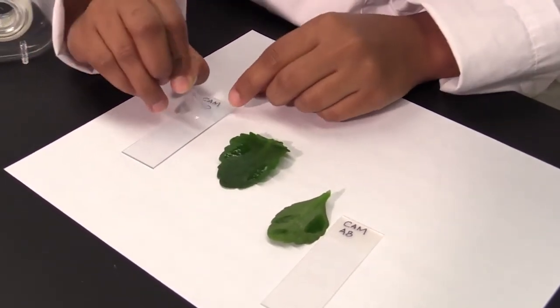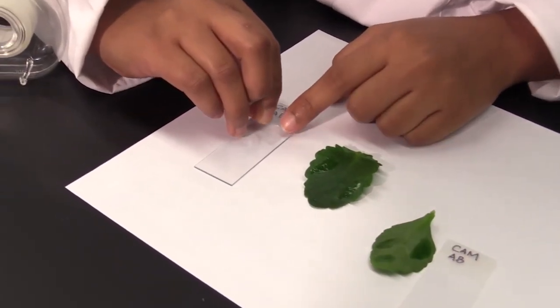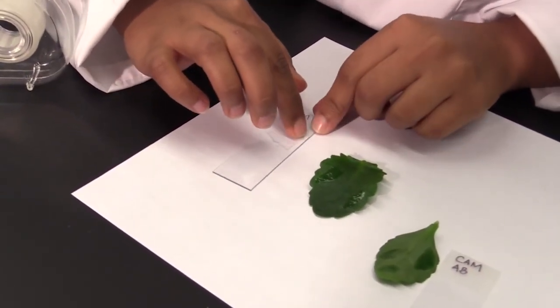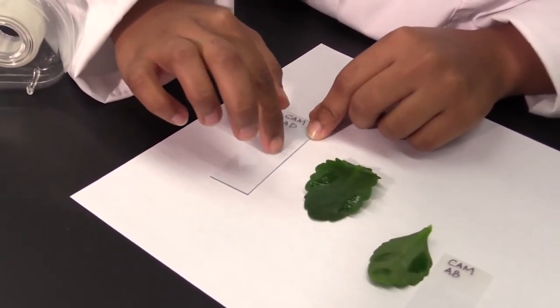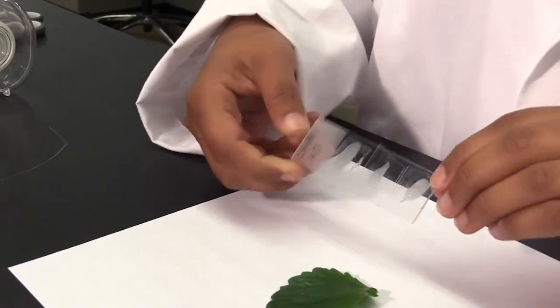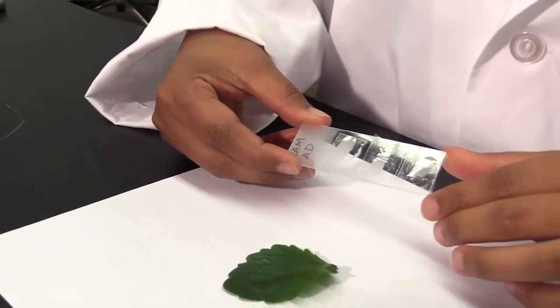Tape your impression to the appropriate microscope slide and use scissors to trim away any excess tape. You can fit three peels onto one slide.